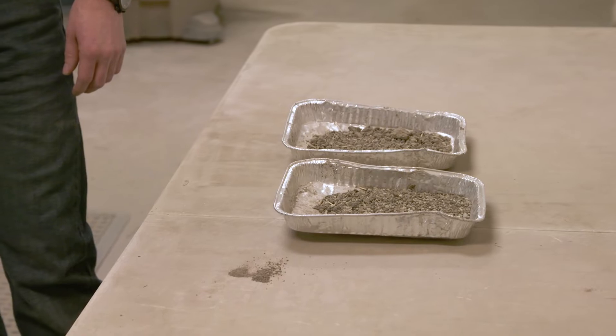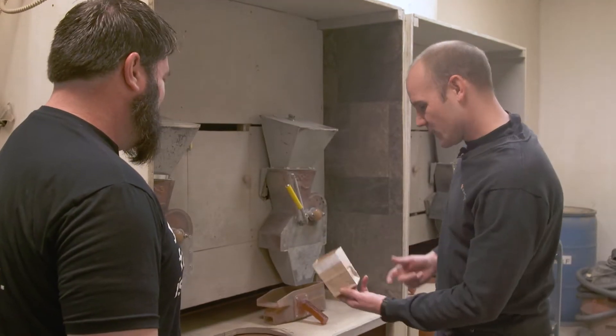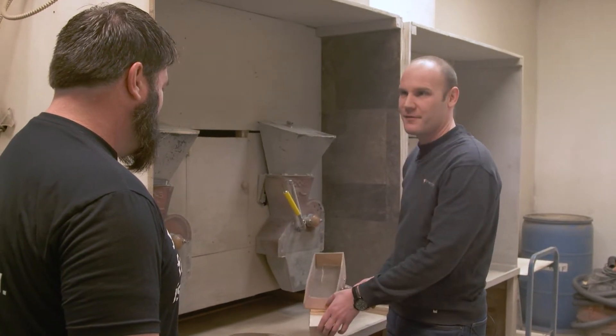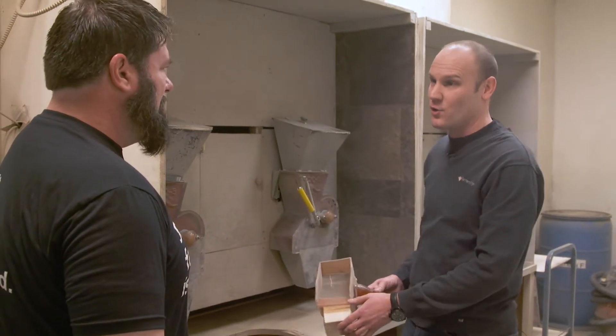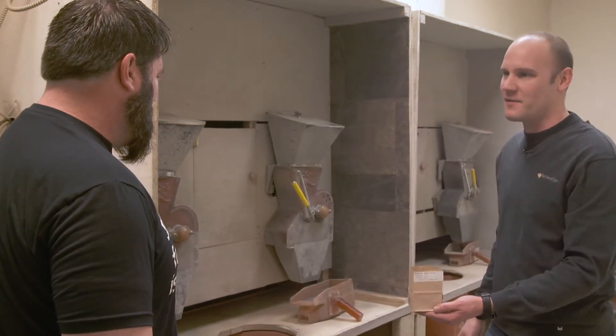After it's done drying, it goes into our grinding room. You've got to homogenize it and get it pulverized down into a fine powder that we can use in the lab. Once that's all ground, you're going to sieve it. Any chaff, stone, anything that's not soil, is going to stay behind. Catch it in the bag and it's off to the lab.